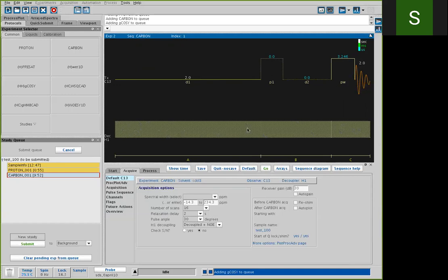On the proton, you're running decoupling the whole time. It's decoupled during the relaxation delay and decoupled during acquisition. The decoupling during acquisition makes the multiplet a singlet. The decoupling during the relaxation delay is the NOE, so that part gives signal enhancement for any carbons that are coupled to protons. So the more protons you have on a carbon, the taller the signal usually is. Usually your methyl carbons will be taller than your methynes, and your quaternary carbons will be the shortest of all, but they also are a little shorter because the relaxation time is much longer.